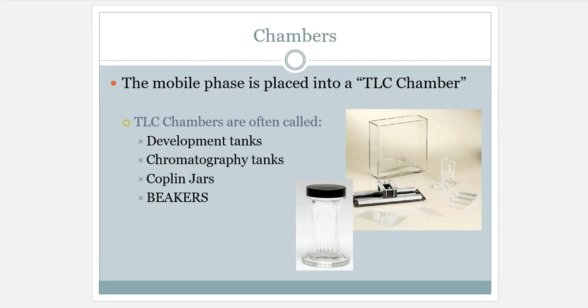And the tanks are going to come in different forms and in different sizes. It really depends on the intention of the TLC development. What are we doing with it? How accurate and precise do we need to be? Or are we just doing this to see some separation and be like a little neat experiment that even a middle school student can appreciate? That's what's going to go on in these chambers.